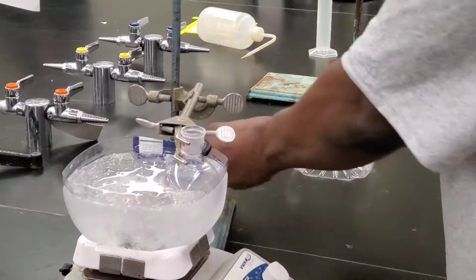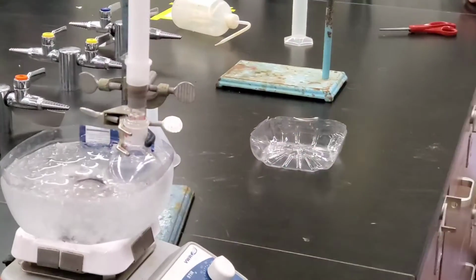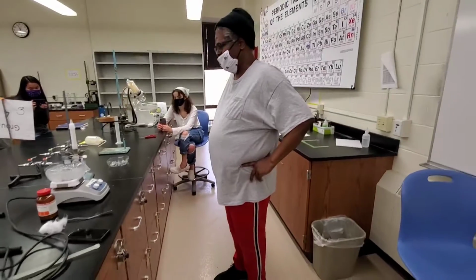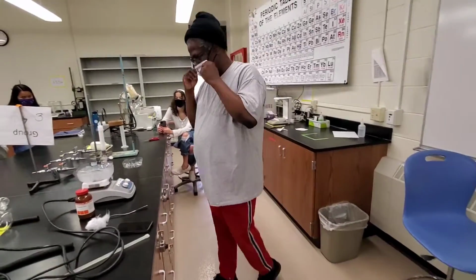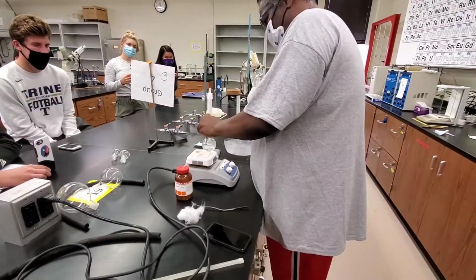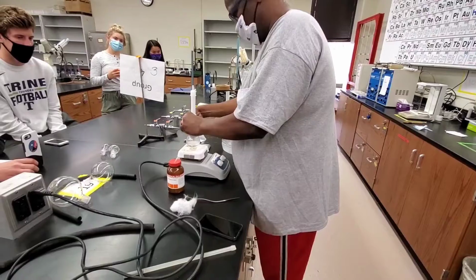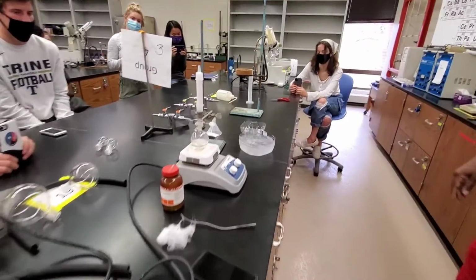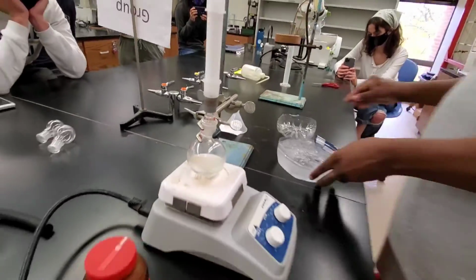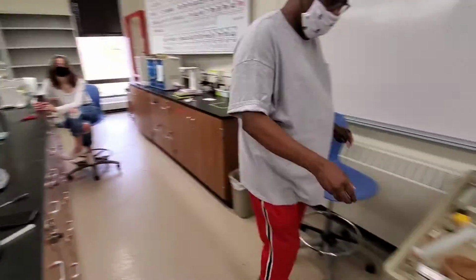All right, so we have our reactant in there, and this is going to do either a cold bath, low temperature, ice bath reaction, or if it's a room temperature reaction, you just have it here like so. Now, if we were going to heat this up to do a reflux, here's what you need to do.